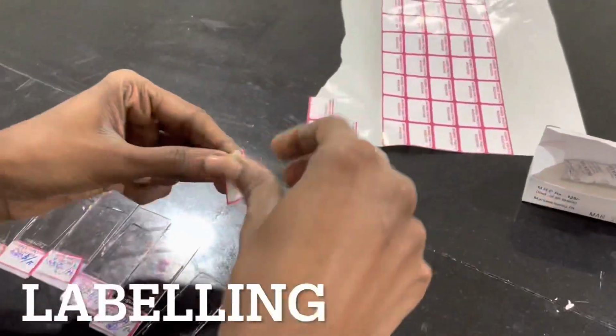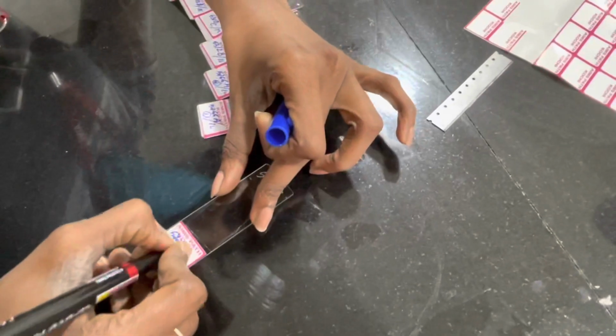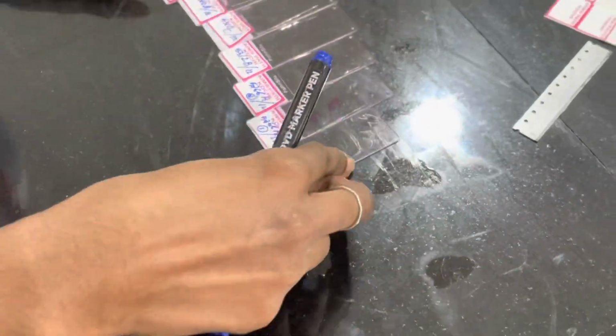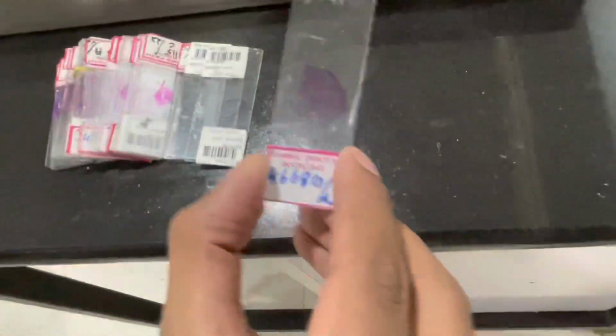The next step is labeling. As we can see here, the glass slide is engraved with the identification code of the patient.